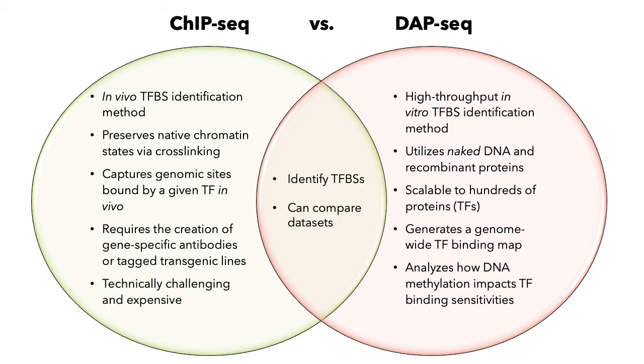How these methods are similar is that they both are used to identify transcription factor binding sites, and ChIP-seq data is often used to confirm the transcription factor binding sites identified through DAP-seq.